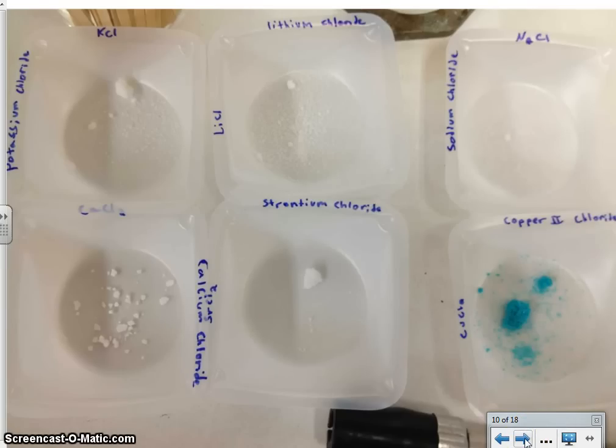Once you have your Bunsen burner comfortably lit and it's burning safely, you'll notice that there are 6 different containers on your lab bench. One is labeled potassium chloride, lithium chloride, sodium chloride, copper 2 chloride, strontium chloride, and calcium chloride. The reason they are all chlorides is because what we are interested in testing is the metal, the potassium ion, the lithium ion, the sodium ion, the copper ion, the strontium ion, and the calcium ion. We want to see what color those ions burn when they're in the Bunsen burner.